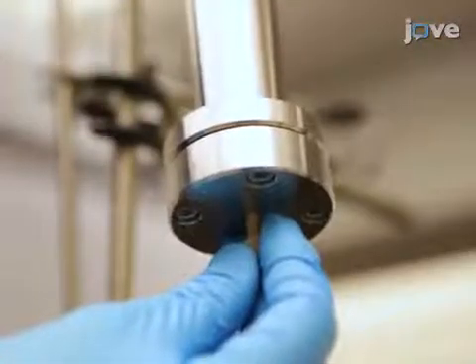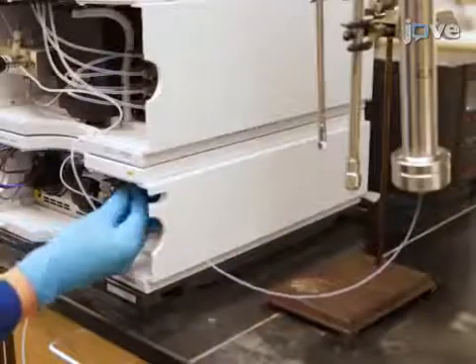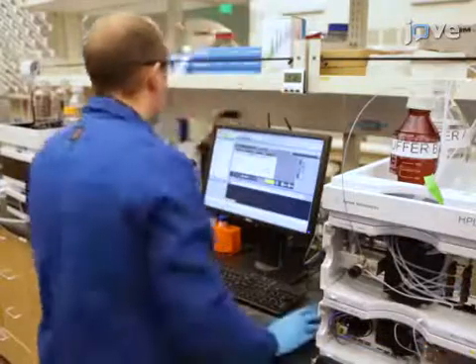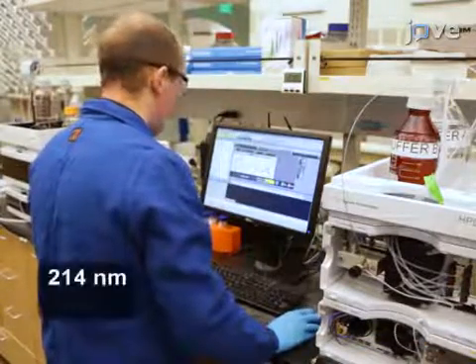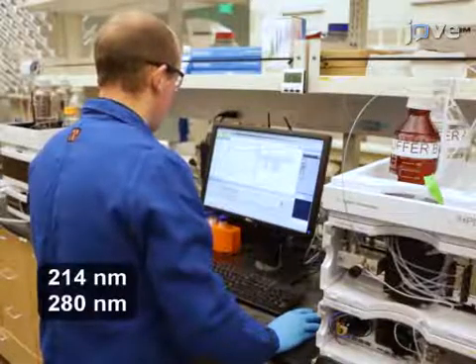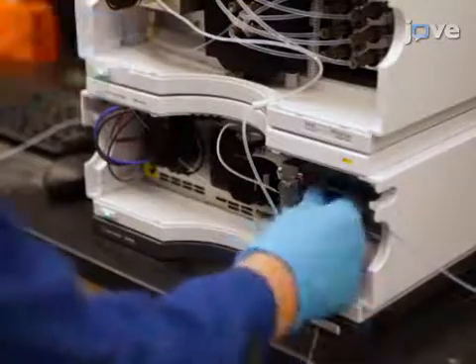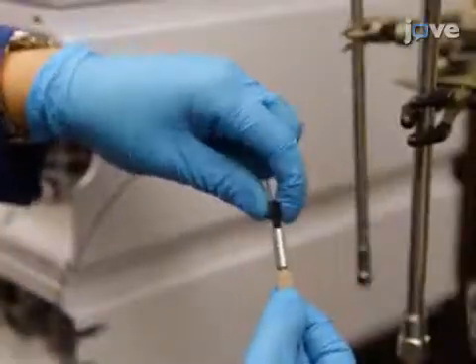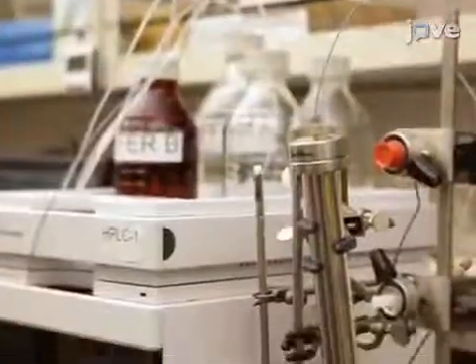Now secure another polymer tube from the outlet of the column to the dual wavelength detector. Use finger-tight one-piece fittings. Then in the HPLC setup software, set the wavelength detector to measure peaks at 214 and 280 nanometers. Next, connect the output valve of the wavelength detector to the outlet valve of the HPLC detector using polymer tubing and a one-piece fitting made finger-tight. This will serve as the sample collection tubing.